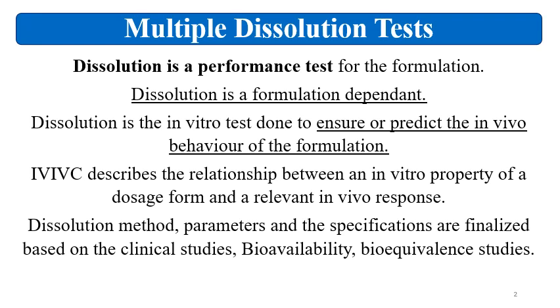Now here we have to understand that whenever the new product is made, for example, you are working on the new type of tablets, that is with specific release or specific release kinetics with the old API. The formulation is new, the API is old.